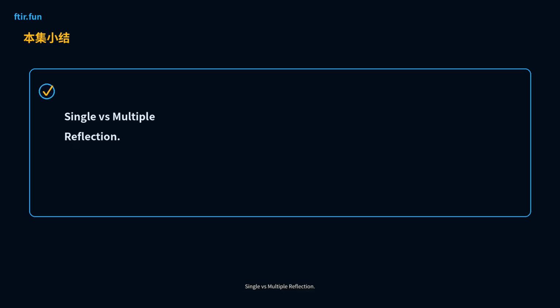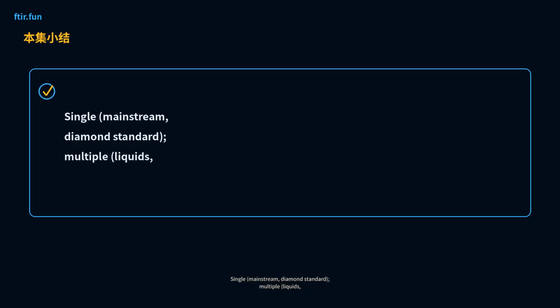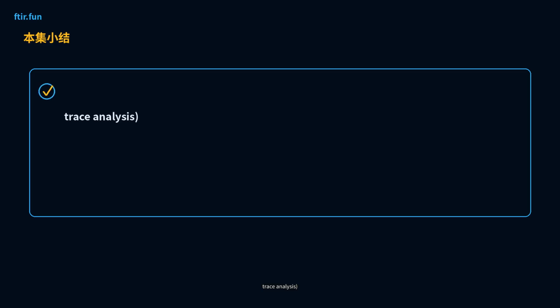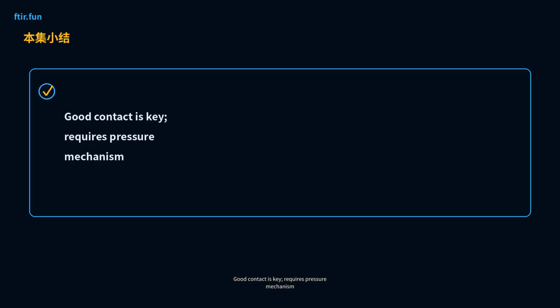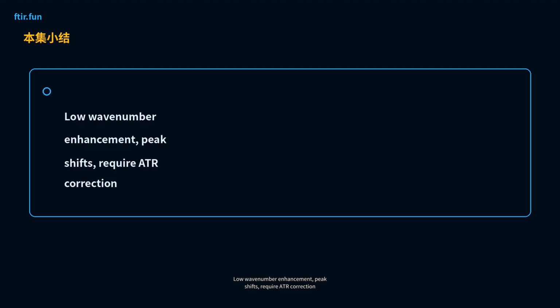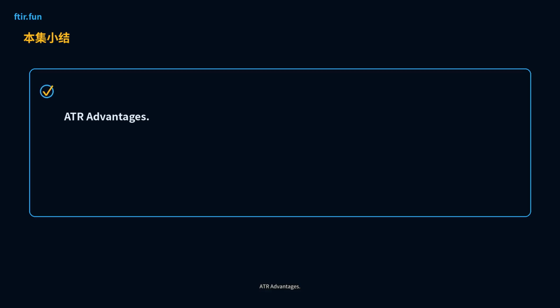Single versus multiple reflection. Single: mainstream, diamond standard. Multiple: liquids, trace analysis. Sample contact: good contact is key. Requires pressure mechanism. Spring, pneumatic. ATR versus transmission differences: low wave number enhancement. Peak shifts. Require correction.